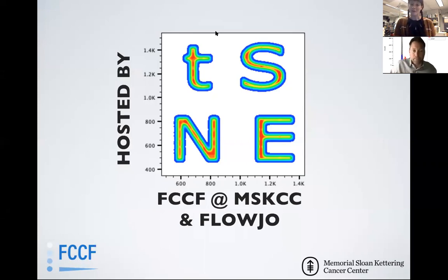For those of us who are joining for the first time, this is our 7th session on FlowJo analysis. Specifically today, what we're going to be going over is some high parameter data analysis utilizing FlowJo. There have been 7 sessions, so as I go along, you'll see some links where I can direct you to our previous session, going over an introduction to FlowJo, specific topics, including one previous session with John where he went over an introduction to high parameter data analysis. So this is part 2.